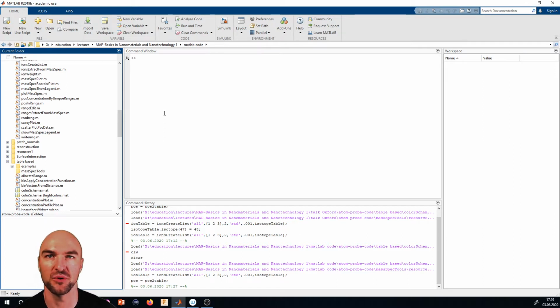I wanted to show you a little bit of our new MATLAB analysis system, which will be coming out soon. And if you signed up for it, you will get to take it for a spin a little bit. Essentially, it's a system that's mostly command line based, so you can script in it, with interaction only where needed. And it's actually a fully fledged atom probe analysis suite.